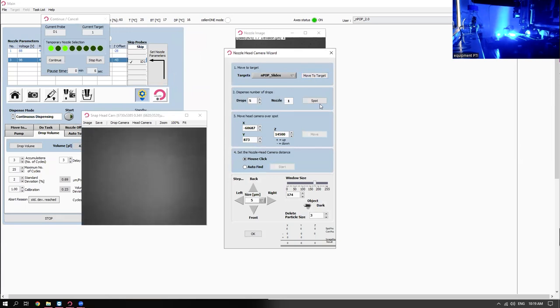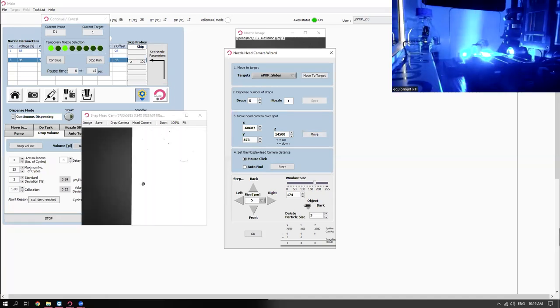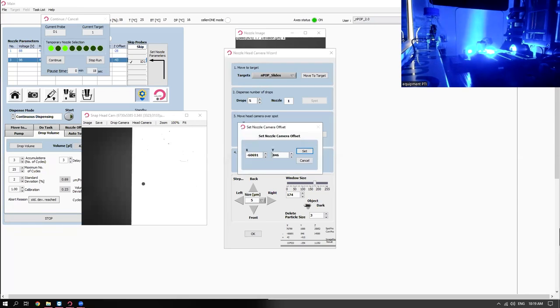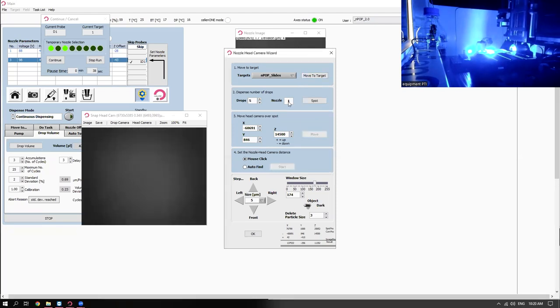We'll move over to the slide. With nozzle one, we're going to dispense 5 drops onto the slide. We'll move over with the head camera, and we're going to click in the center of that drop. So this is the offset in microns from where I clicked, essentially the offset in microns from the center of the head camera image to where that drop is. Then we're going to move back to target and do the same thing with nozzle 3.